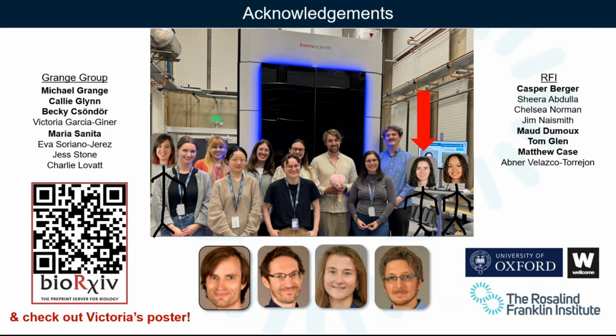Yeah. Basically, instead of going through the front, imagine your block, we take a shallower angle through the top of the surface that's flat afterwards. So you're not making it through the curtained front, you just tilt it and make a bit of a deeper lamella, but you have a smoother surface to make that on. Because we tried making it through the front and they just fall apart.